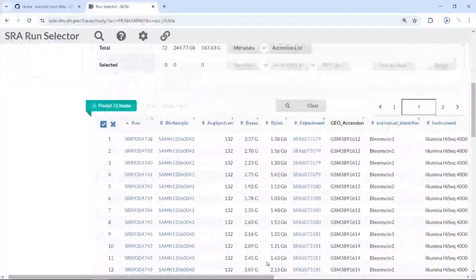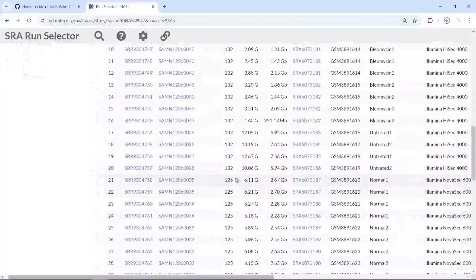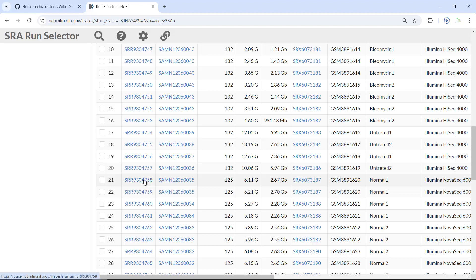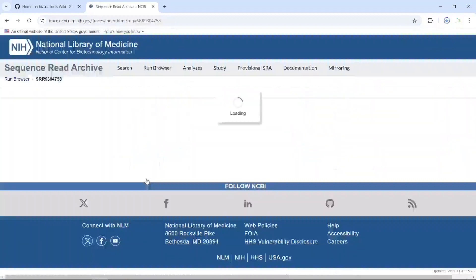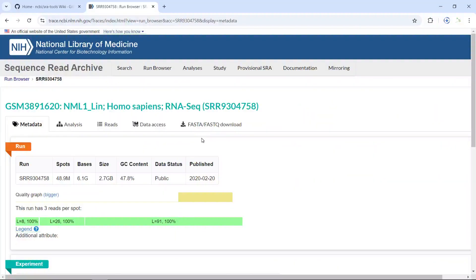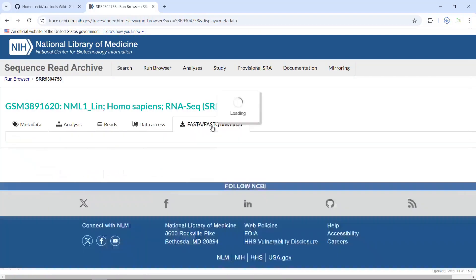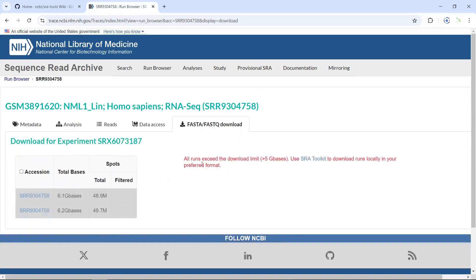Now if we click a human sequencing dataset — for example the first one — you can see this dataset is bigger than 5G. Let's click the link. You still have the FastA and FastQ download links, but clicking them shows that the sequencing data exceeds the download limit of 5G.